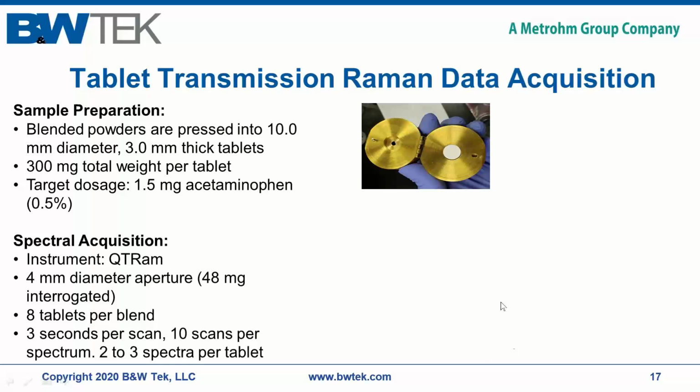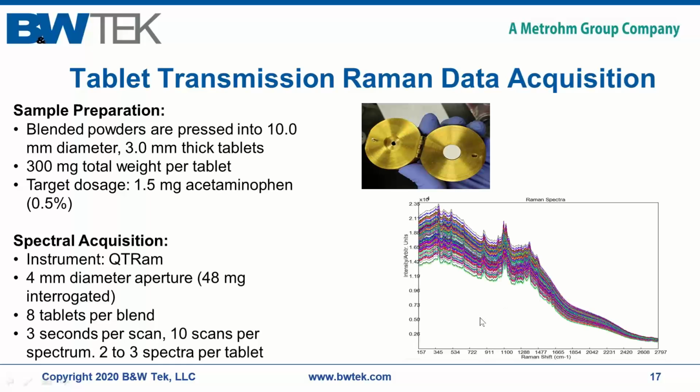So this background here is fluorescence, so it's not masking the peaks. We still see the peaks that are up here. And in building our calibration models, we applied a first derivative as well as a normalization to our data to minimize these effects. But if we have stronger fluorescence, it can interfere and mask our ability to develop calibration models.